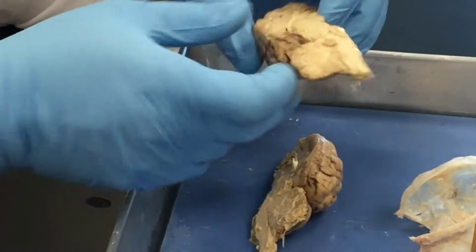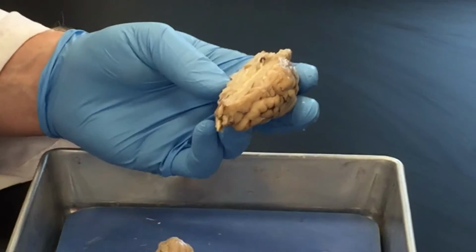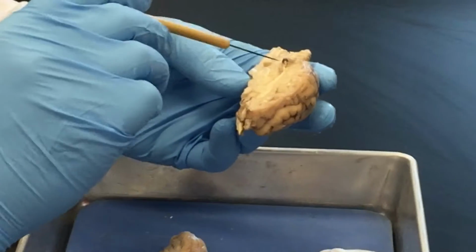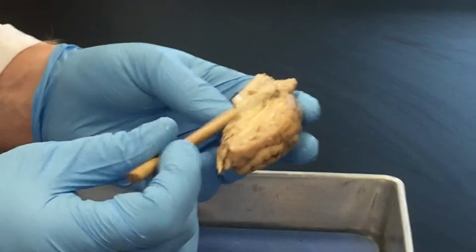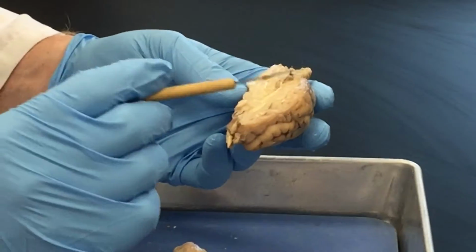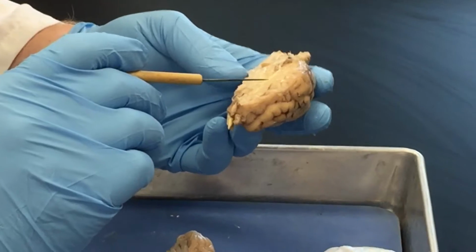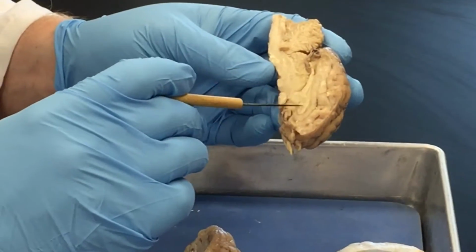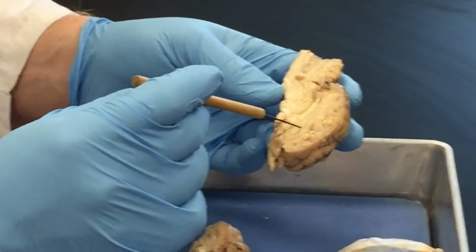Okay. So here we have the sagittal section of the brain, which is how most of your brains will be presented on the practical. So from the inside here, arbor vitae of the cerebellum, you don't have to label it as arbor vitae, just cerebellum's fine. Cerebrum, that white matter bridge right here. So if I put a pin right there, that would be corpus callosum.